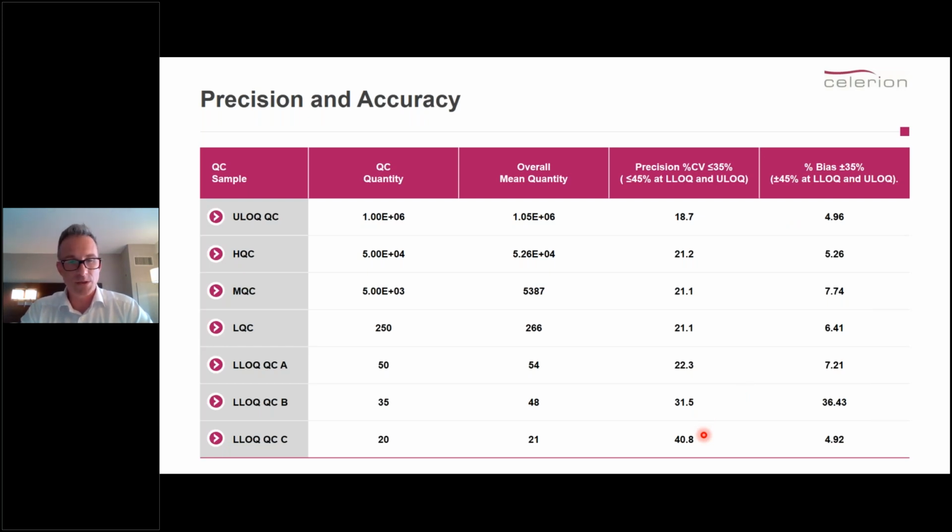And the LLOQ by definition is the lowest concentration you can determine with an appropriate accuracy and precision. So again, here is something where I feel that needs to be done experimentally rather than just theoretically. I know a lot of labs would just choose 50 as the LLOQ because many years ago in one of the regulatory documents, 50 was used as the limit of quantification as an example for biodistribution studies, which then has been broadly applied to absolutely every method. However, I do think this needs to be experimentally tested and shown here.